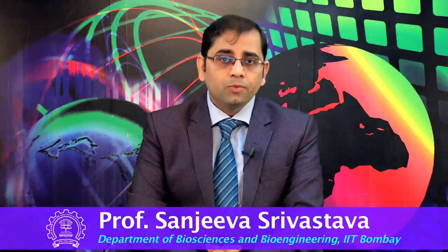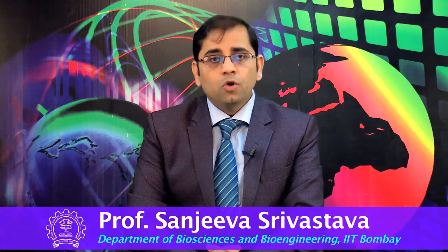After understanding the sequence-centric proteogenomics, we will now listen to Dr. Kelly Regel's talk about variant analysis and its effect on other biomolecules leading to various clinical conditions. She will also talk about how to read .vcf files and about informatic tools for creating customized databases. She will discuss how one could create a variant peptide manually by using Integrative Genomics Viewer, or IGV, to understand the basics. However, once we have understood the basic mechanism, one can use different software to develop variant peptides.